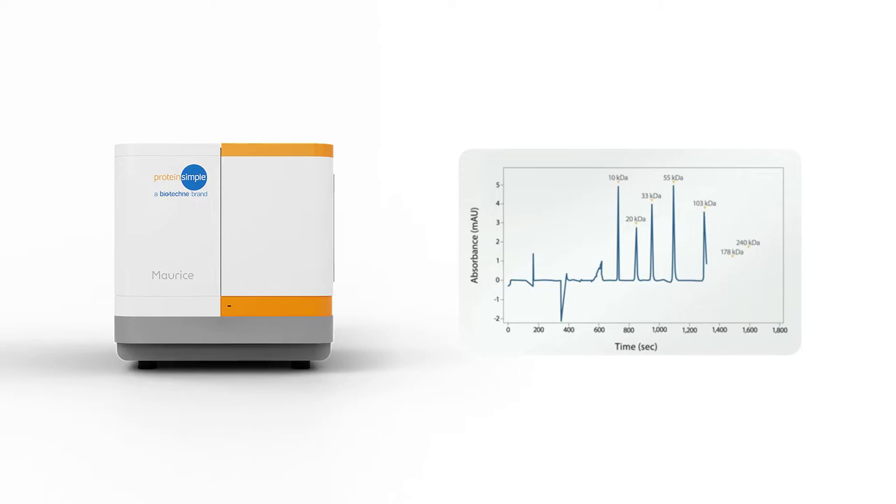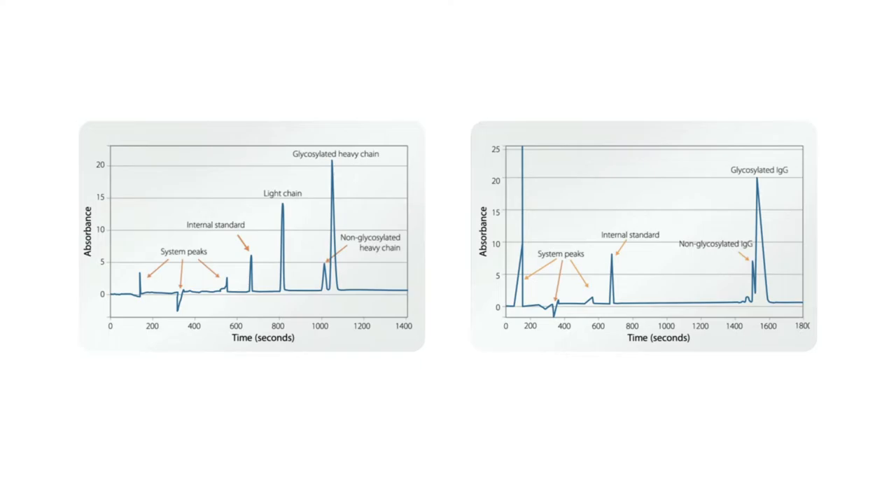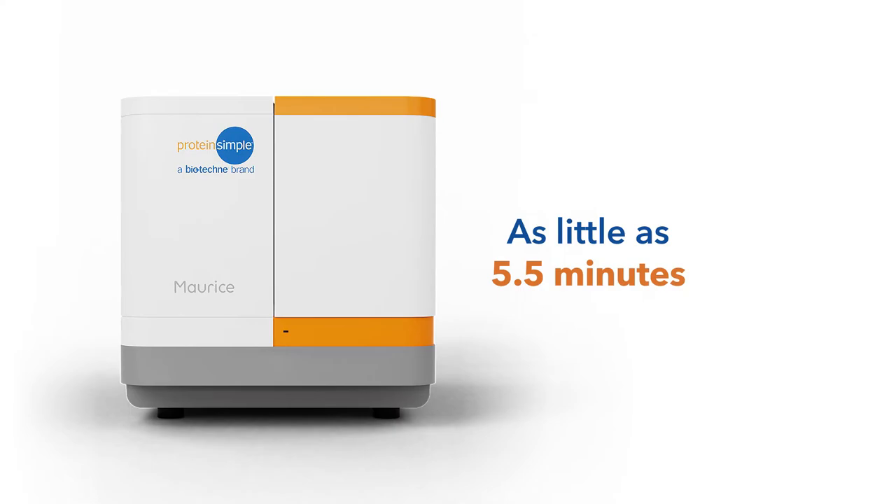With Maurice you can analyze molecules in a wide molecular weight range. With this streamlined workflow you can get reproducible results fast in as little as five and a half minutes, helping you to get your purity and size heterogeneity data faster.